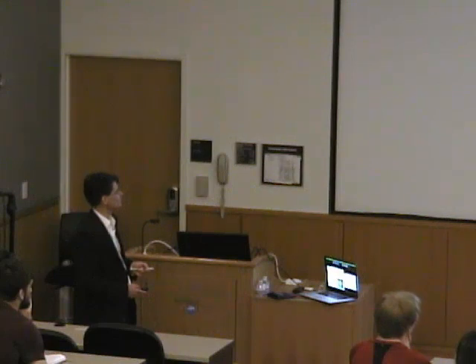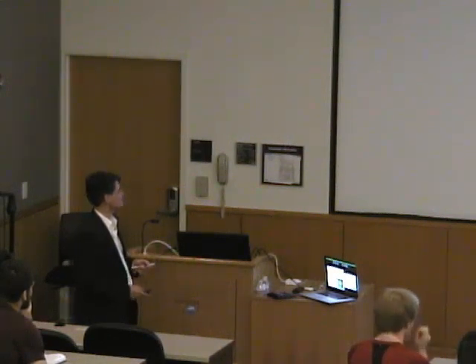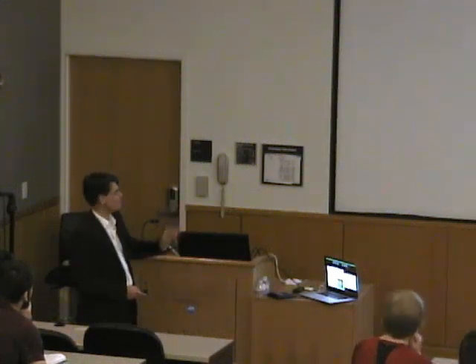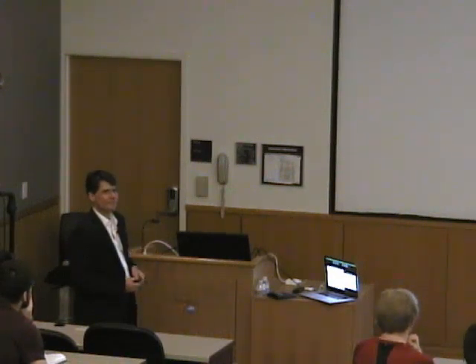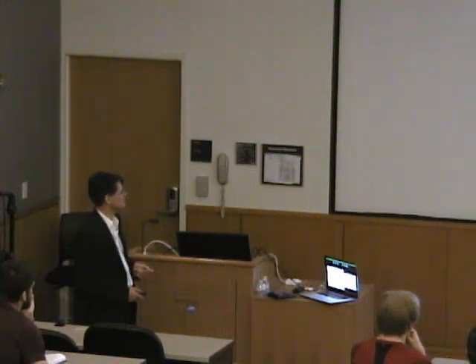And now we get a bit into the scary parts, and we move more towards the theory of it. And well, okay, listen to this guy. And then if it's too hard, it's probably not worth doing. But at least the next few slides I show you, they're worth doing. I promise. So now the MCD signal can be positive or negative, and there are two distinct cases that you can normally distinguish. I don't know if you care about it, but I tell you anyways.